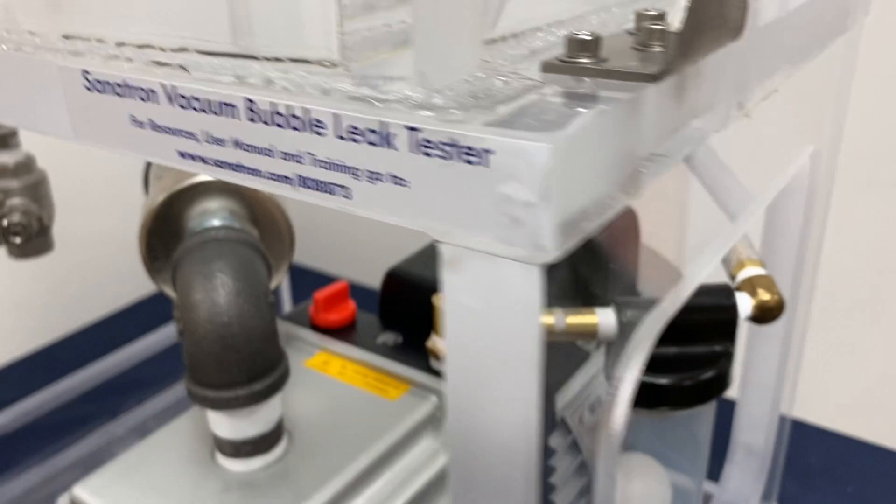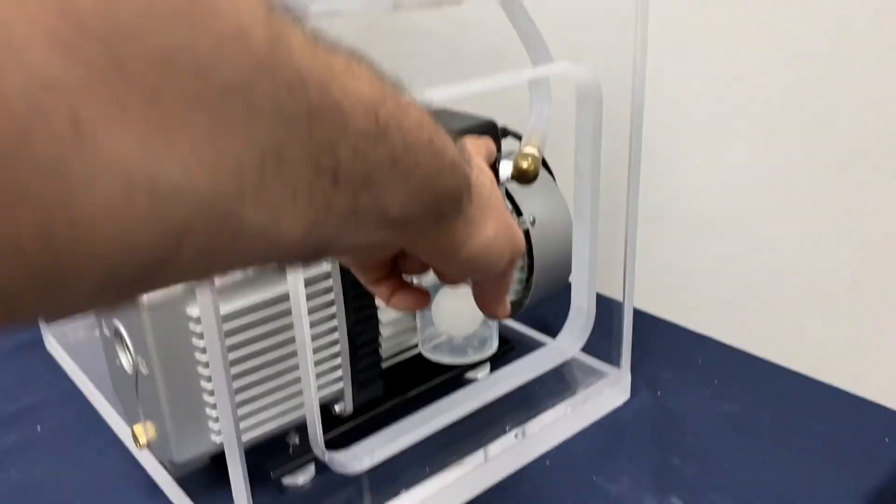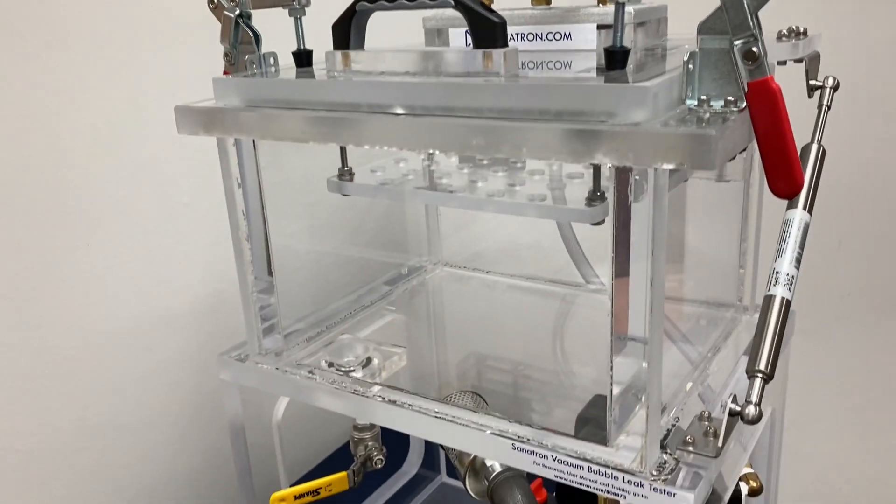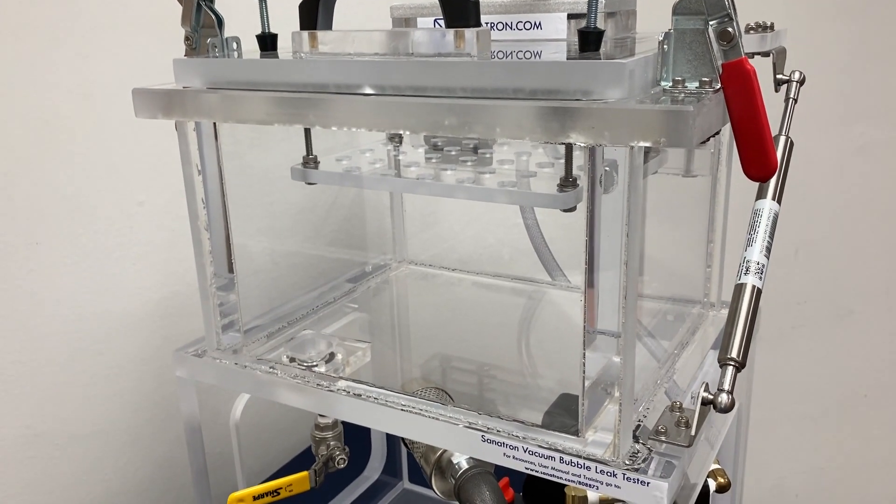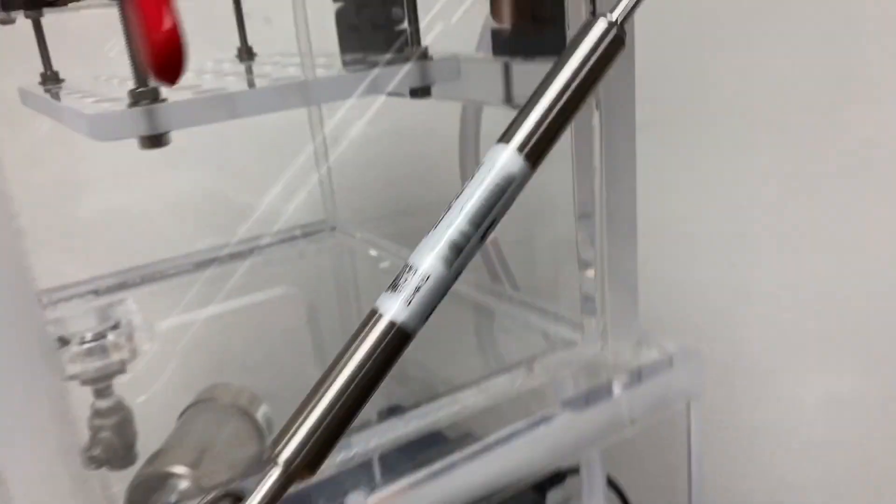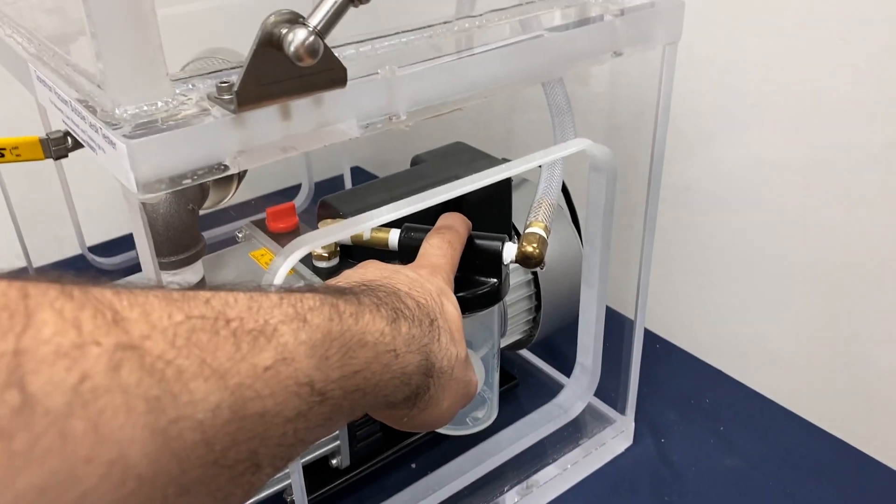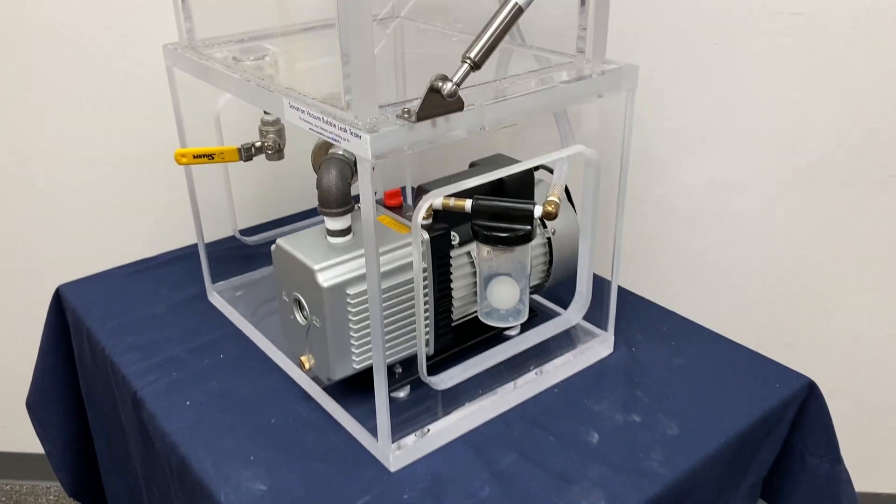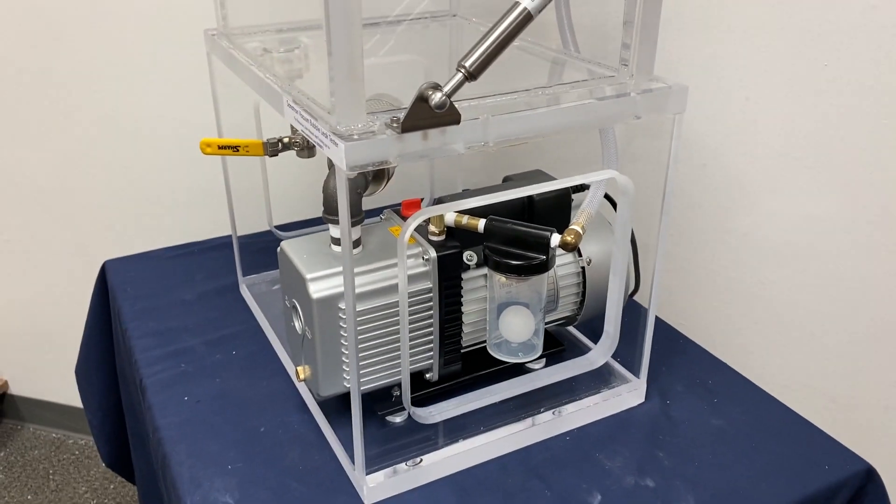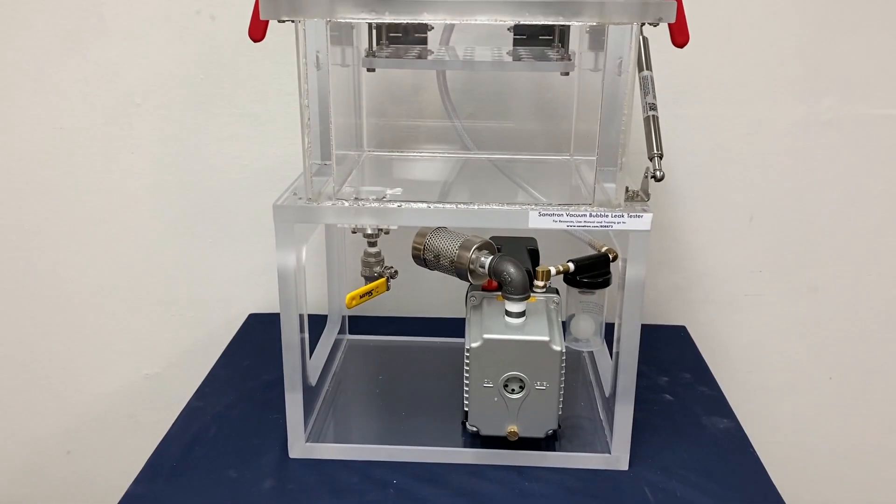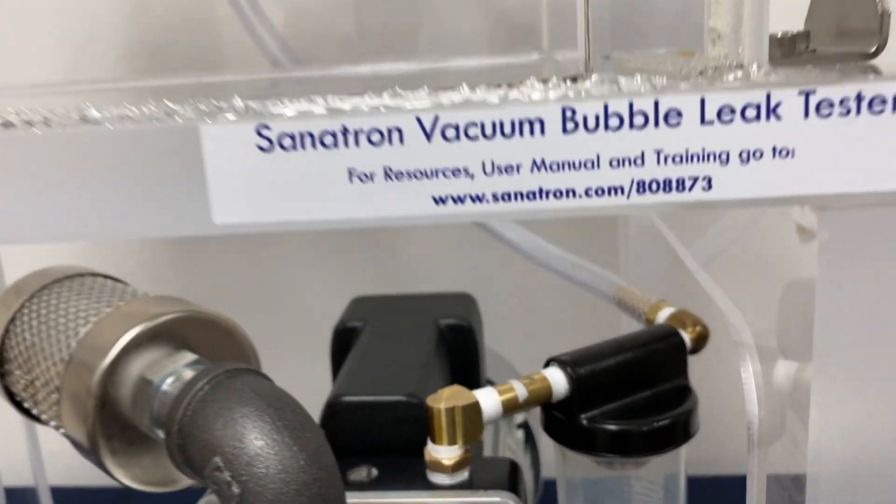Here's another cool feature that is not very standard: a vacuum pump water protection valve. It comes as standard on all of our systems. If you ever happen to overflow and overload this water tank, when you pull a vacuum your specimen will expand and start pushing water from this tank into this vacuum line, which could pull water into your vacuum pump. To prevent this, we've added a vacuum pump protection valve where this ping pong ball will float and close this valve when it fills up with water, preventing the vacuum pump from ever getting water into it. So you will never damage your vacuum pump.